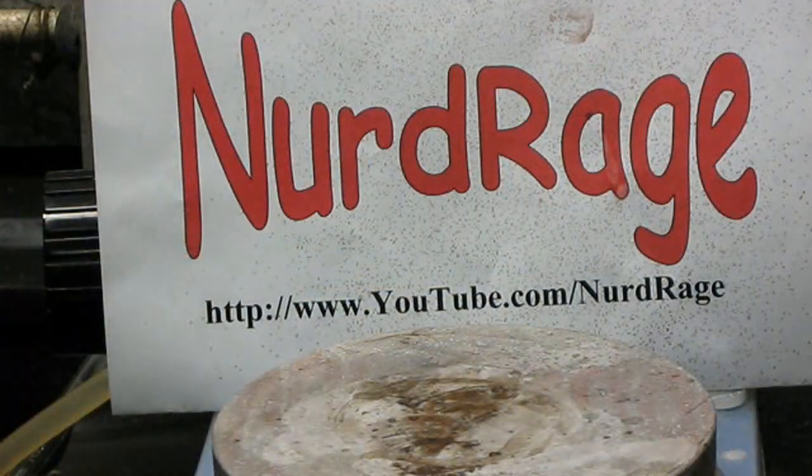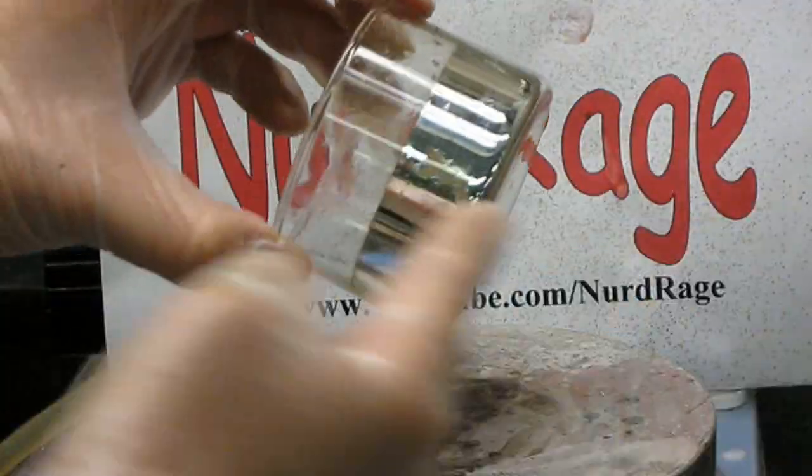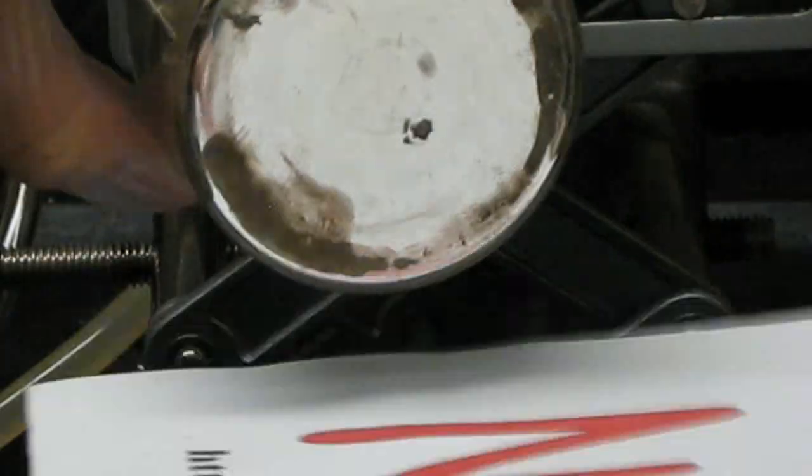Let me dump the solution and show you the container. Obviously when you do your reaction you should use a much cleaner container than ours. As you can see, the layer is highly reflective.